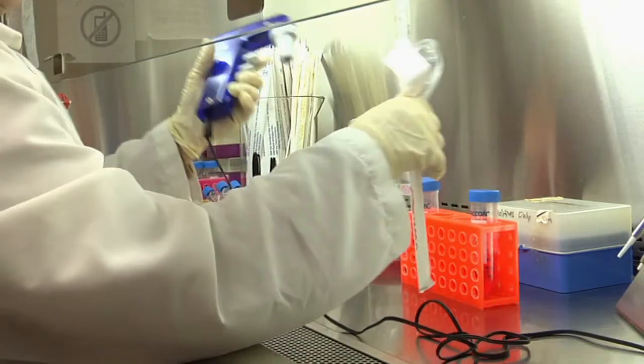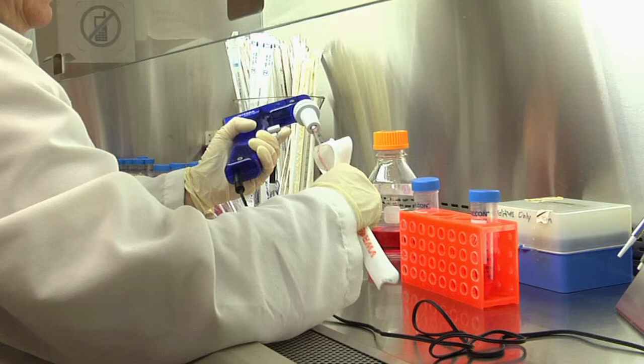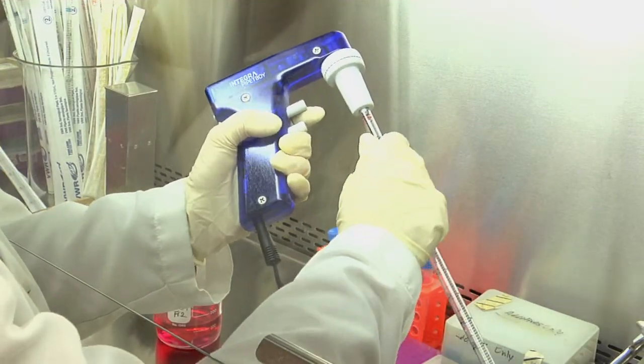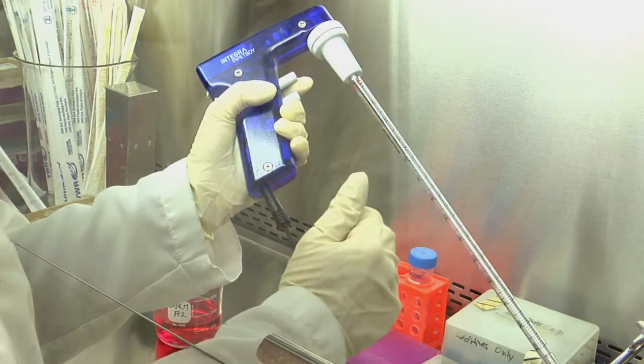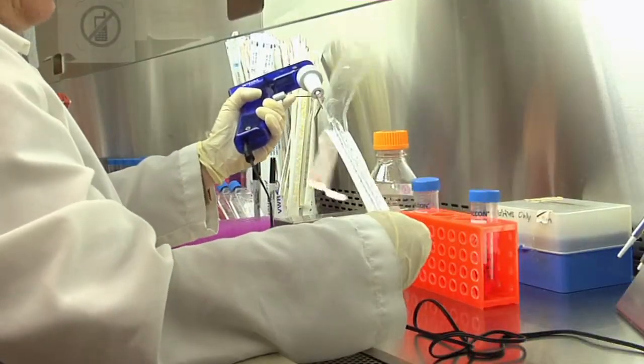Once you have opened the paper wrap a third to half of the way, place the pipette in the pipette holder by holding the pipette towards the top away from the part that will be in contact with the sterile liquid and making small twisted movements to firmly anchor the pipette. Then grab the end of the paper wrap and quickly pull it off the pipette.